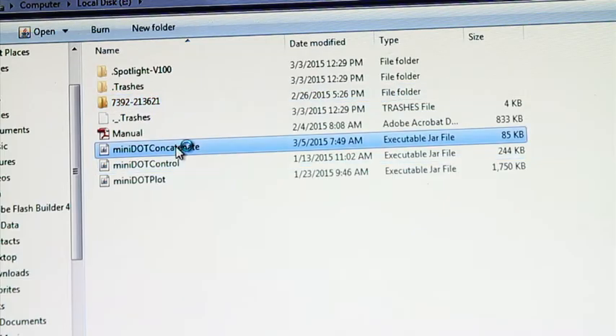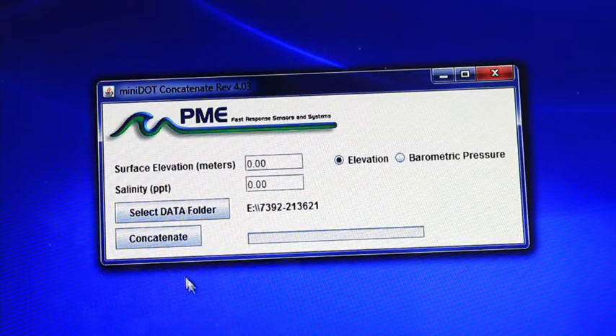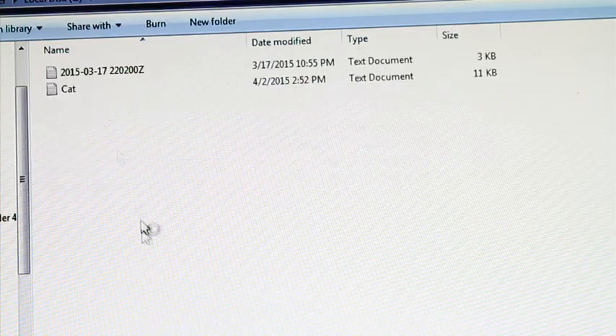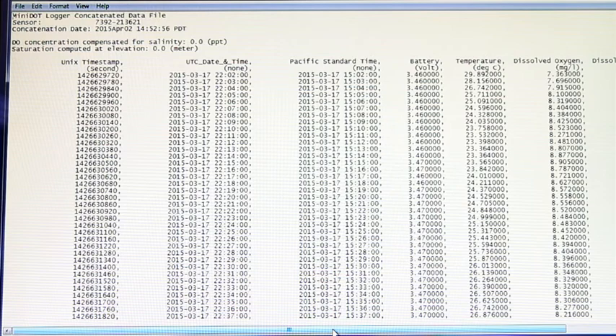To view the data text file, run the mini dot concatenate program and click the button concatenate. The new file will be located in the data folder. In this file, you can view mini dot measurements.